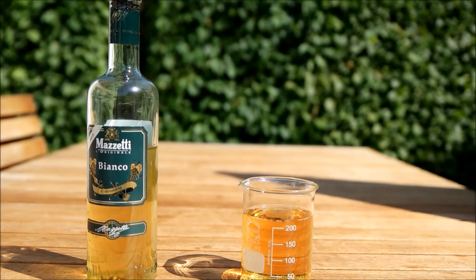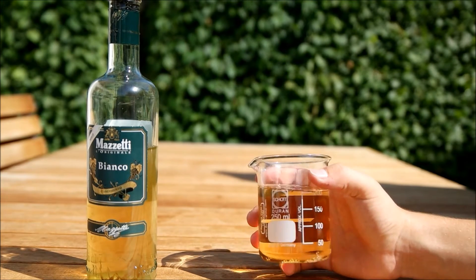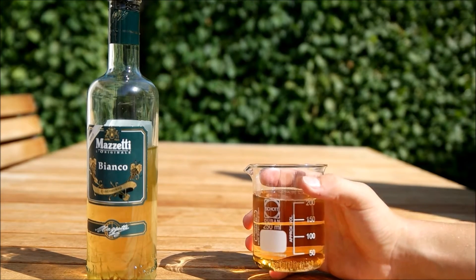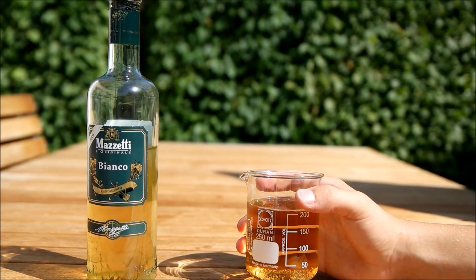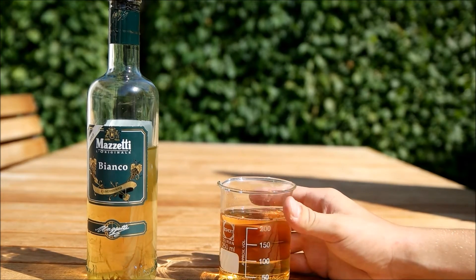Today we are going to work with Acetobacter. Acetobacter is pretty interesting bacteria because they can oxidize ethanol by producing acetic acid. I'd like to do a few experiments with them.